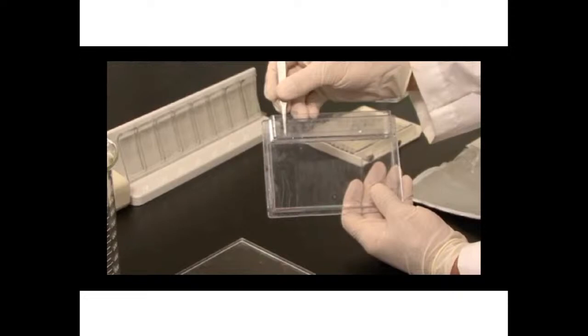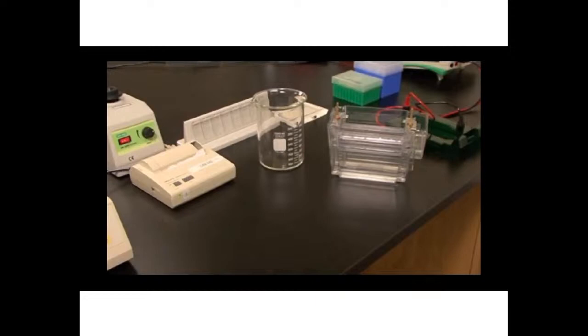Insert the leads into your power supply. Program for 200 volts for 1 hour, constant voltage. And start. The second dimension gel has now completed running. You know it is finished when the dye front has reached the bottom of the gel.